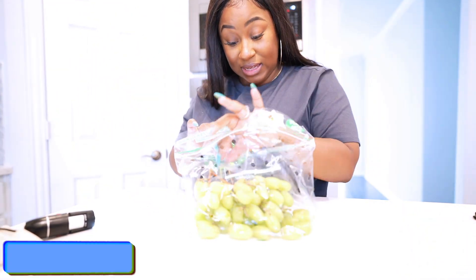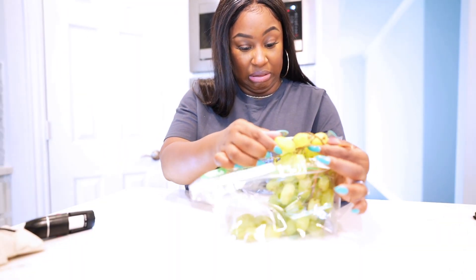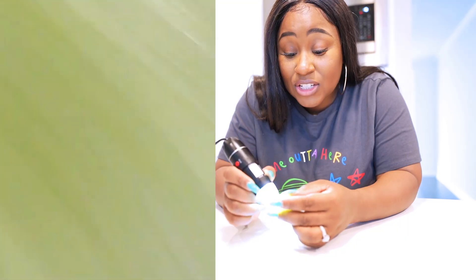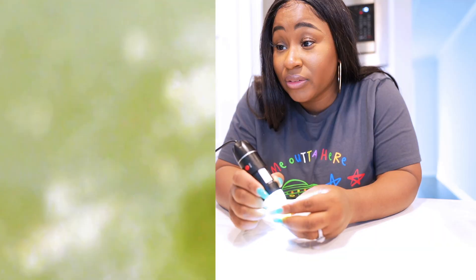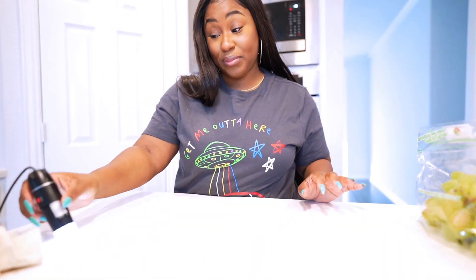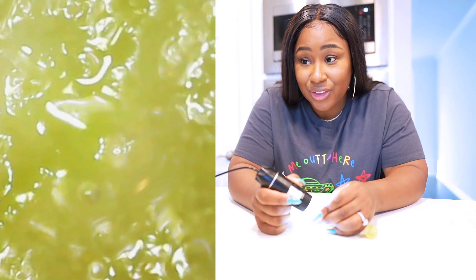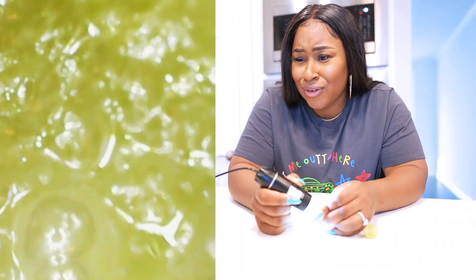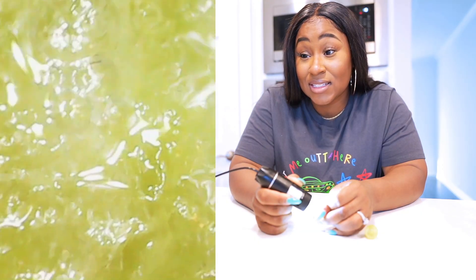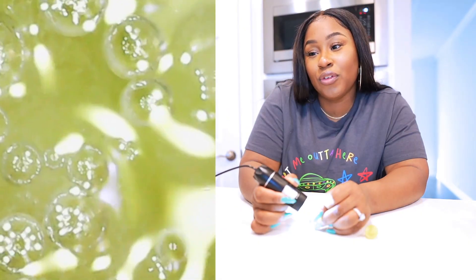Grapes — let's see what grapes look like under a microscope. I'm trying to pick a good one. This grape is looking smoother than my skin, for real. I want to see the inside of a grape. Oh, look at that juicy stuff! Let me squeeze it a little bit — oh yeah, look at that juice. This is satisfying. Excuse me, inside of a grape — that is a beautiful picture. Look at that!